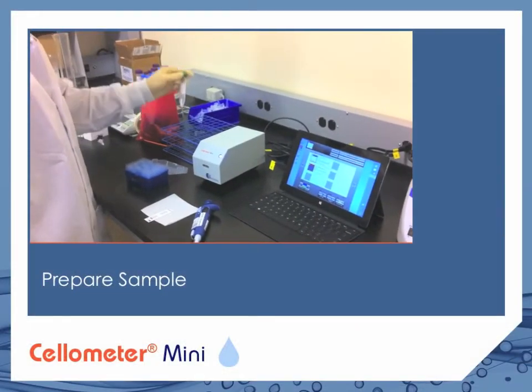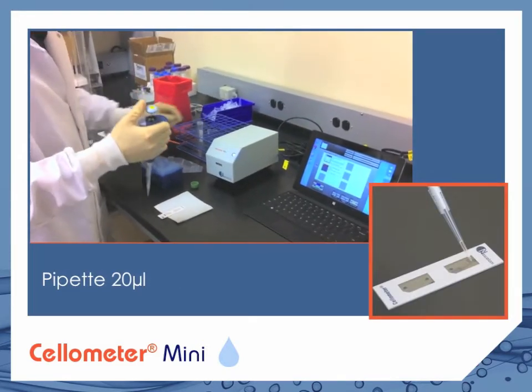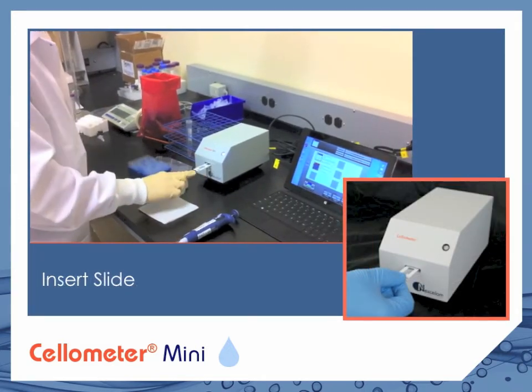Prepare your sample as you normally would. Then pipette 20 microliters into a Cellometer counting chamber. Insert the chamber into the Cellometer Mini.